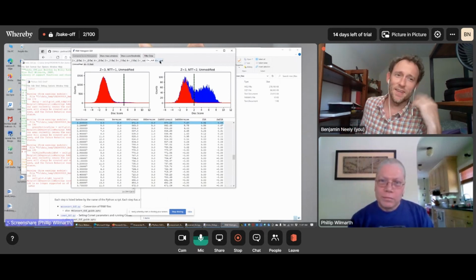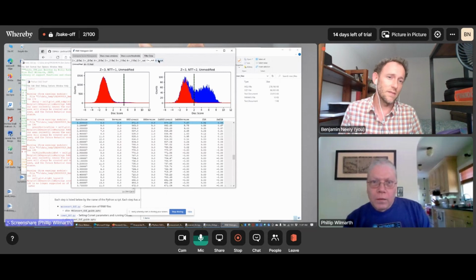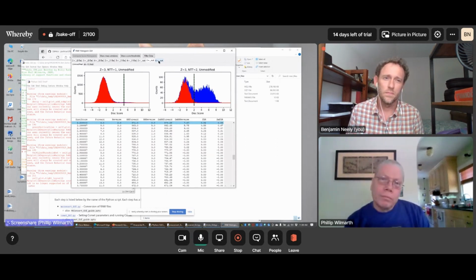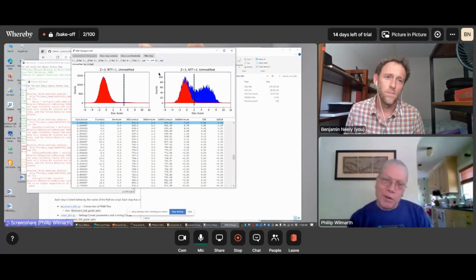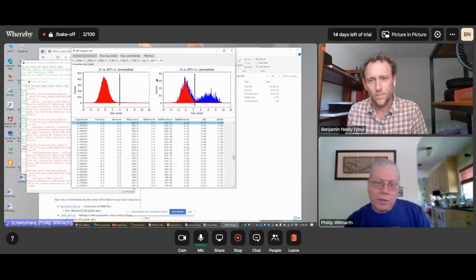That took me a little bit this afternoon to process. And you said that might be an extra few percent of IDs. Yeah. Okay. Cool. And it's going to depend on the sample, the acquisition method, and the instrument. But it's something that's in there by default. So basically, for everything that the instrument scanned and sequenced, we look at the score distributions. Some have accurate masses and some don't. Usually the ones that don't are not super abundant, but they do look pretty solid.